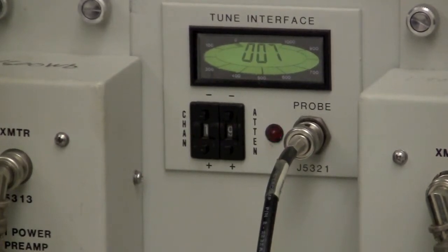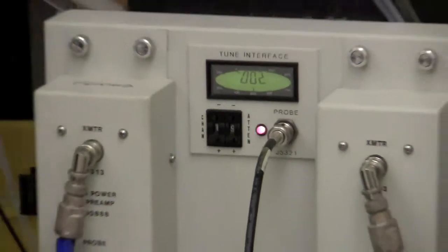Continue iterating until reaching the minimum. A value around two is probably good enough for the proton channel. Now we can tune the carbon channel.